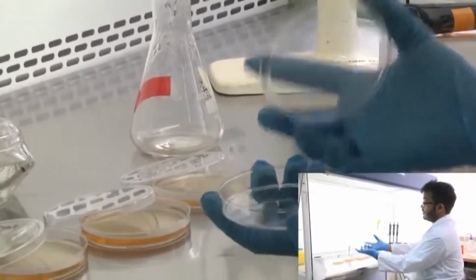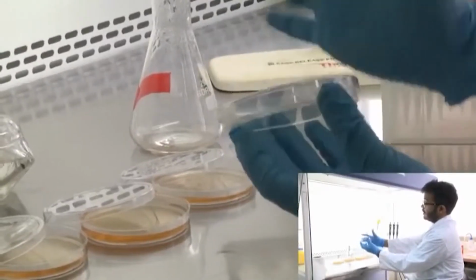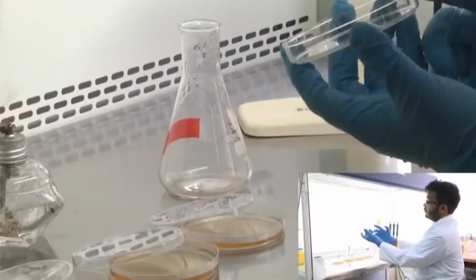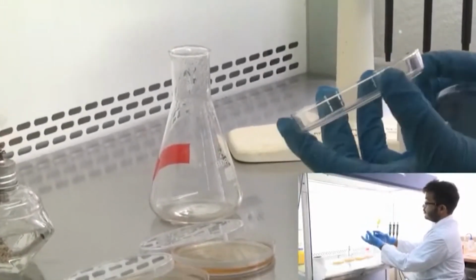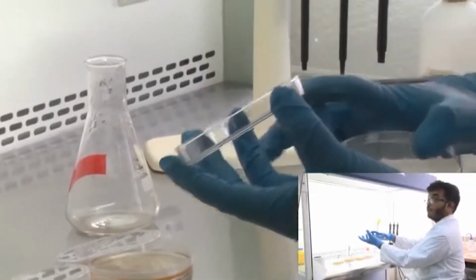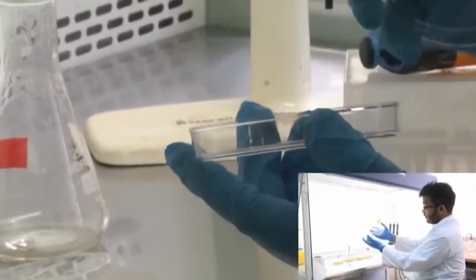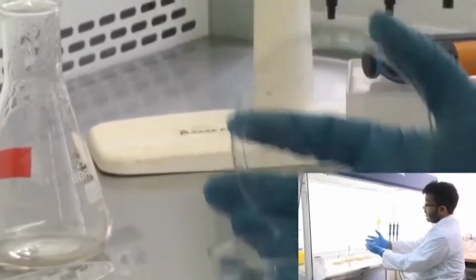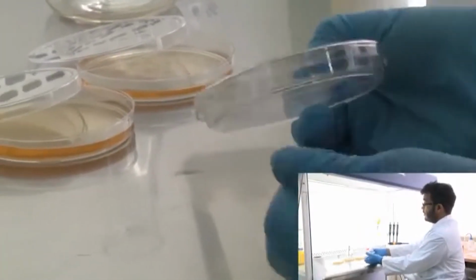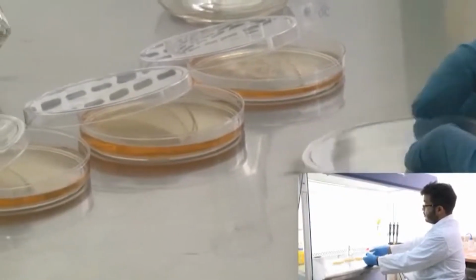There is an inner dish and an outer lid. The diameter of the outer lid is greater than the dish, so that it can cover it. And what we did was, you see the dish, we tried to ensure that maybe 2/3 of it is covered with the LB agar media, and the rest of it is kept empty. After we pour it and it solidifies, we are going to close the lid and leave it like this until we are ready to plate our bacteria.